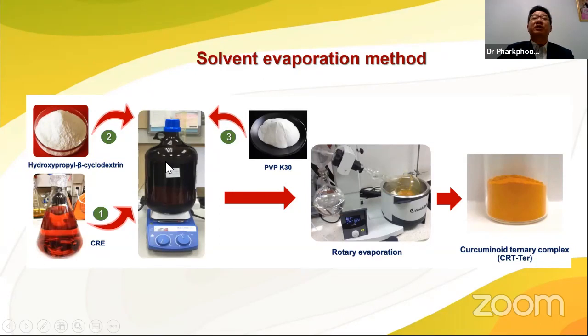for solid dispersion. And after evaporation, we will get the curcuminoid-rich extract ternary complex. This we call the solvent evaporation method.